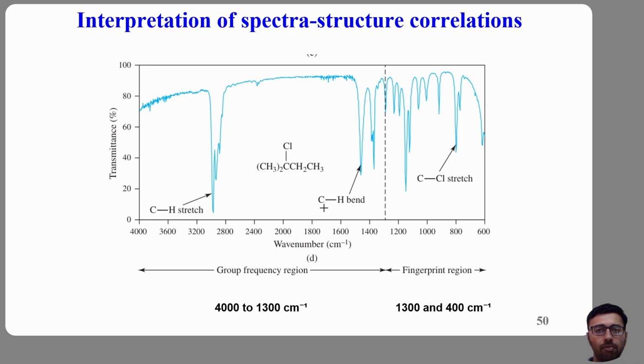Third mistake is forgetting solvent peaks. Always identify solvent absorption before interpreting the analyte. Mistake 4 is water contamination. Water contamination is one of the most common causes of confusing spectra, especially in KBr pellets.